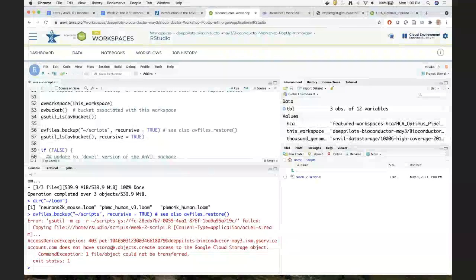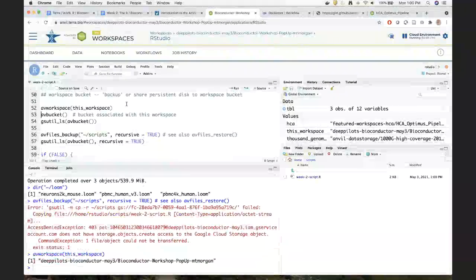Martin, could I ask what happened with that AV Workspace HCA command? It seems like you can just pop around between different workspaces and copy files from them into your runtime, into your persistent disk. Yeah, cool, eh? Is that a feature that's going to stay, or is that something that is going to go away with notebooks being tied to runtimes, or will it stay tied to workspaces?